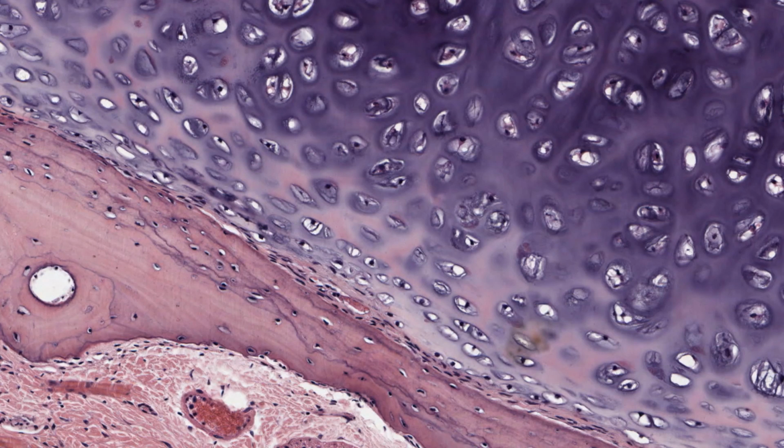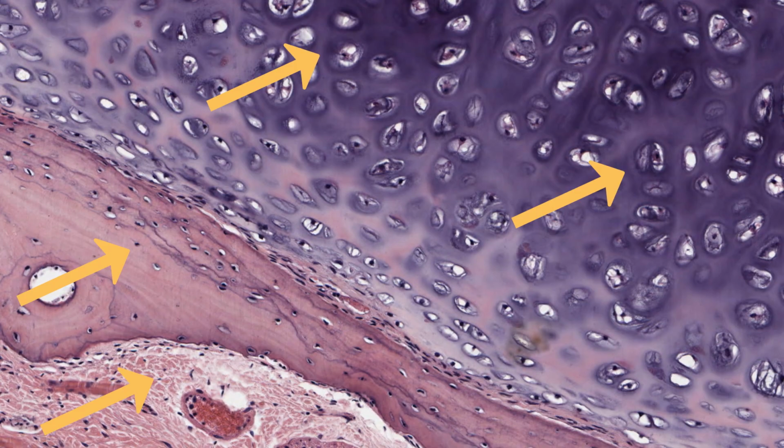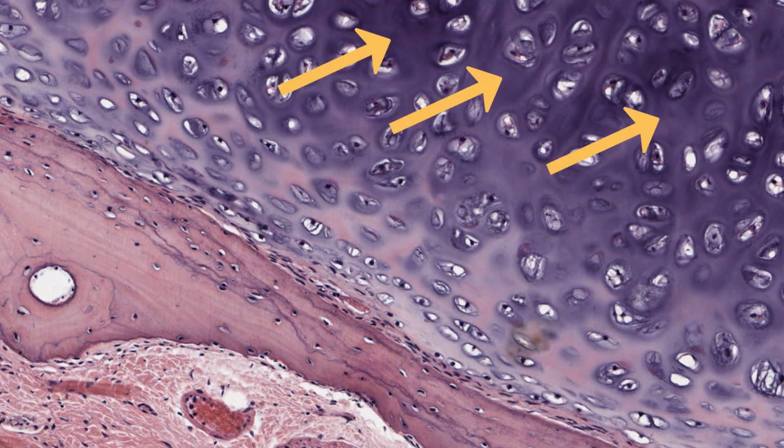This is an image of mostly hyaline cartilage. There is some bone here and collagen here. The extracellular material, or more specifically carbohydrates in the matrix of cartilage, contains lots of ionized sulfate groups, so exhibits basophilia. It's reacting with the basic dye, and that's hematoxylin.